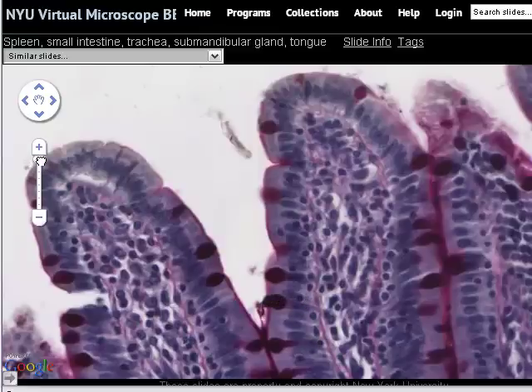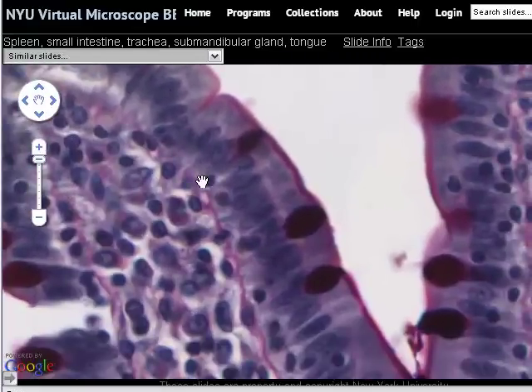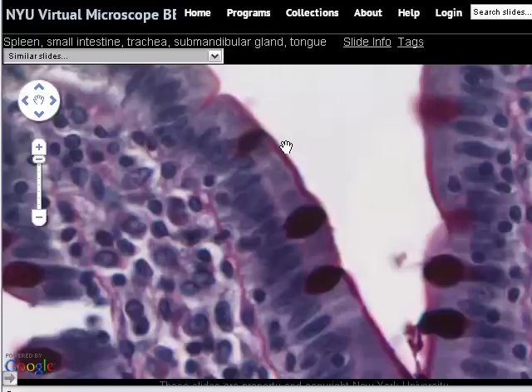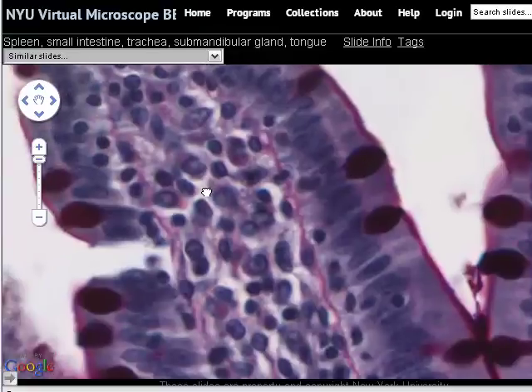One other thing worth noting is that there are modifications to the surfaces of the simple columnar cells lining the small intestine. These modifications are finger-like projections of the apical surface of the cell, and they're called microvilli. Microvilli are non-motile, in comparison to cilia which are motile. Although we can't see the individual microvilli — there are probably three to five hundred per cell — they appear as a structure stained with a red color, giving a brush-like appearance to the tops of the cells. This appearance is referred to as a brush border. So the formal classification is a simple columnar epithelium with goblet cells and a brush border.